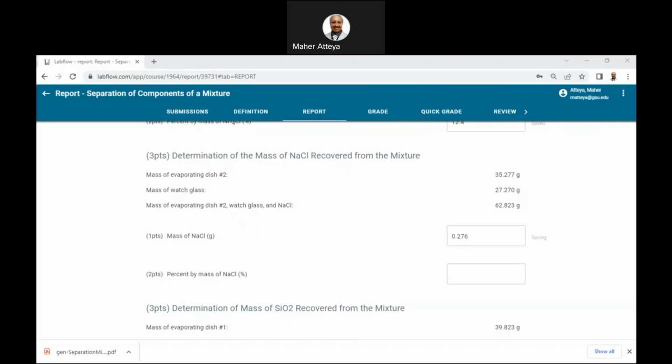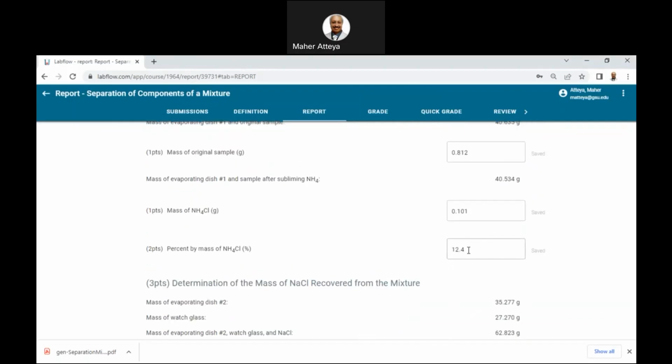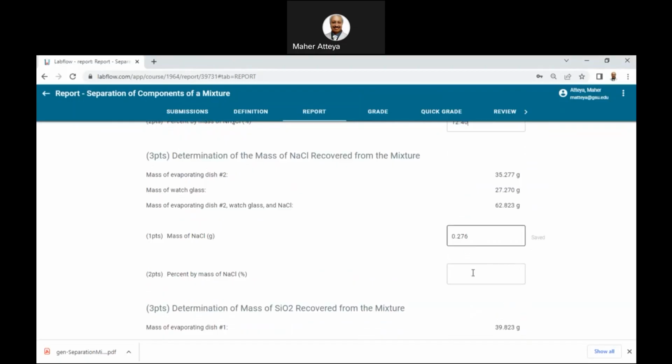So this is 12.40, and this one here is 33.99, copy it.